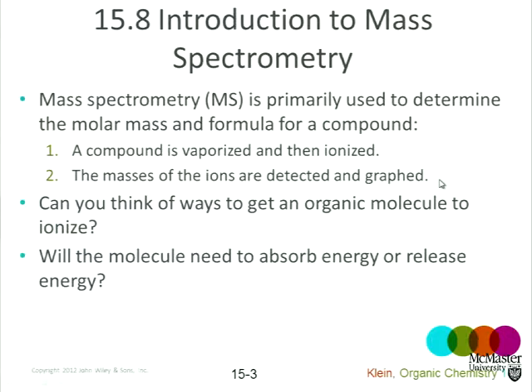In general, neutral molecules are stable. If I want to add an electron to a neutral molecule where all the bonding molecular orbitals are filled, where do I have to put an electron?